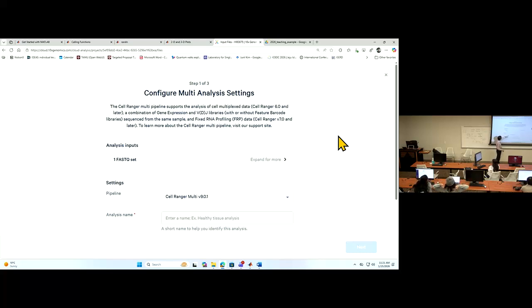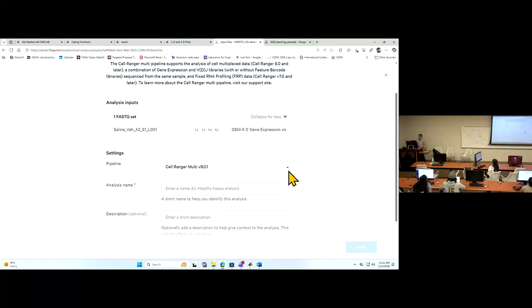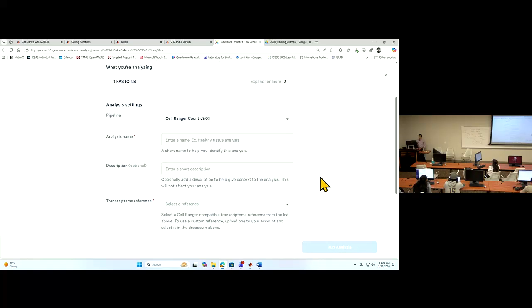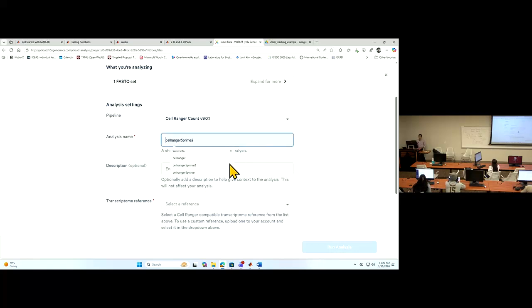And you will select the pipeline. Because you only uploaded one set, there's only one available for you to choose from. Here you have different versions, and we just need the count. So select this count.